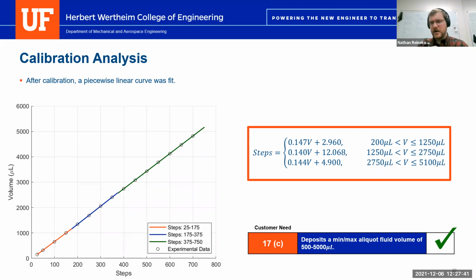So unless the aluminum itself degrades over time, which it shouldn't within the 10 years, because it should only be interfacing with air or whatever air-like substance is in the design when it's put into the incubator, it shouldn't degrade. It is a pretty easy calibration to do as long as you have an accurate measuring unit. But I don't think it should be an issue within the 10 years that it's allotted to function.